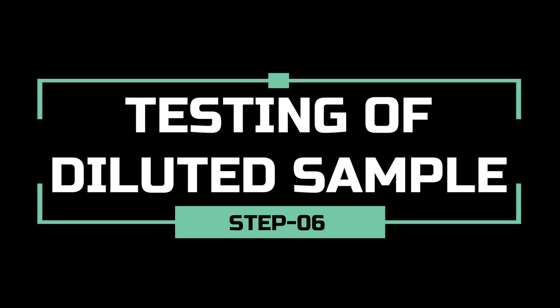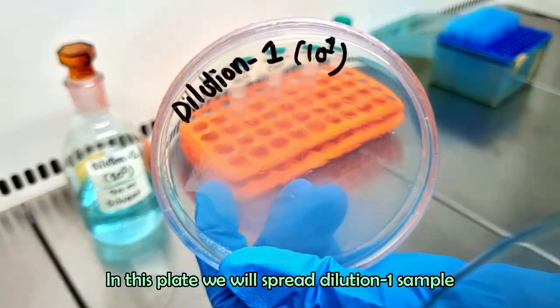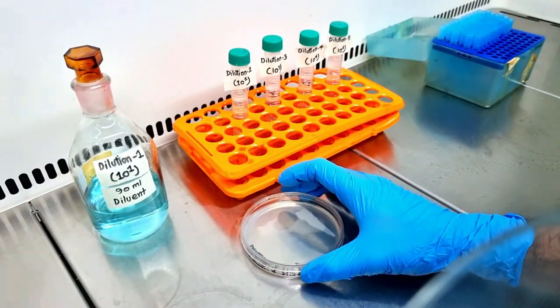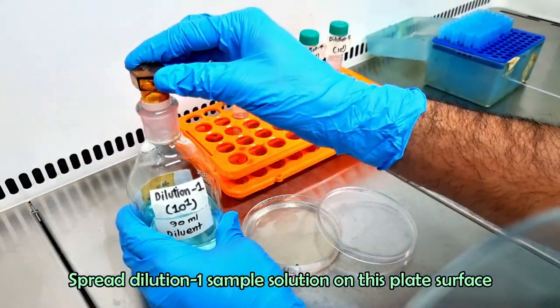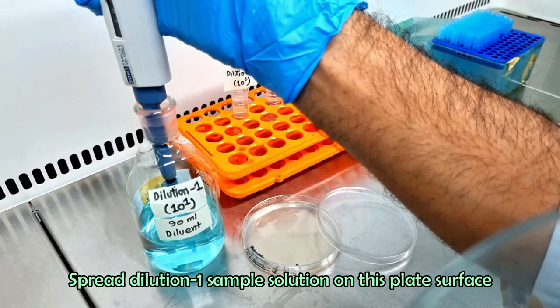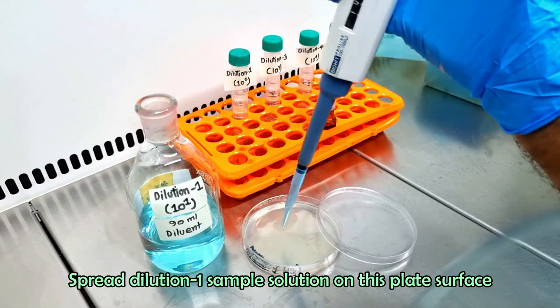Now we will analyze our diluted sample for microbiological test and chemical test. This analysis will help us in better understanding of the calculation part. Let's consider each dilution tube as individual sample. We are spreading each diluted samples on agar plate surface.